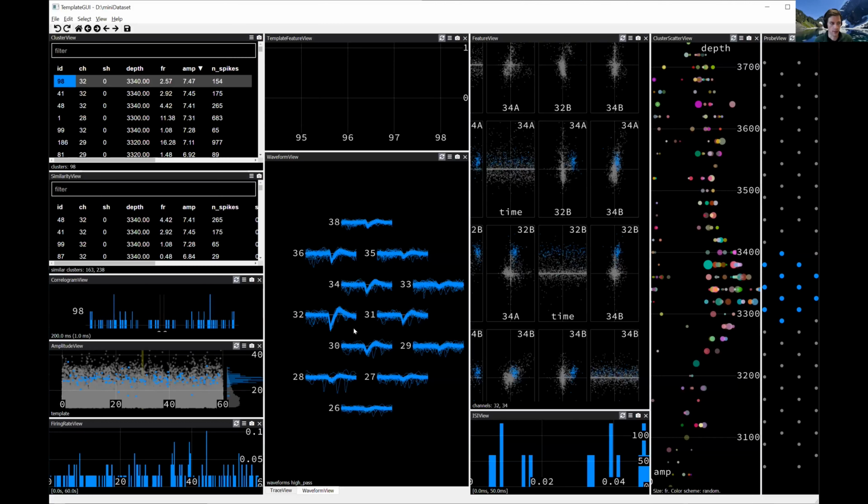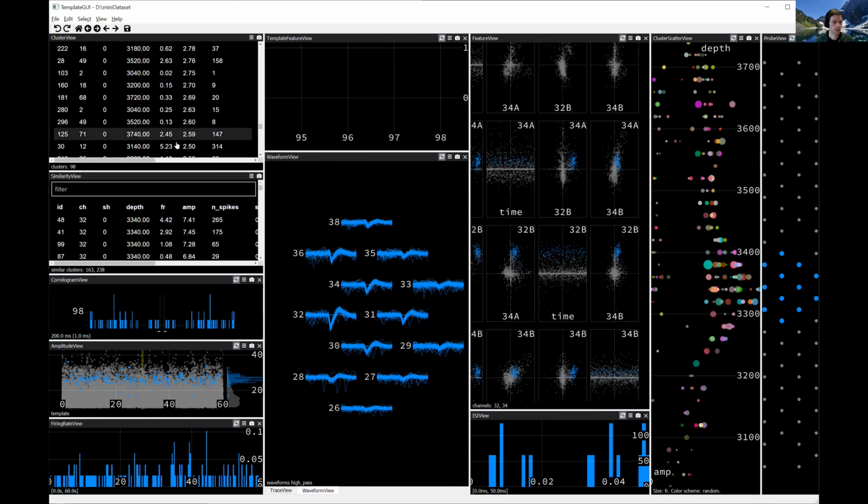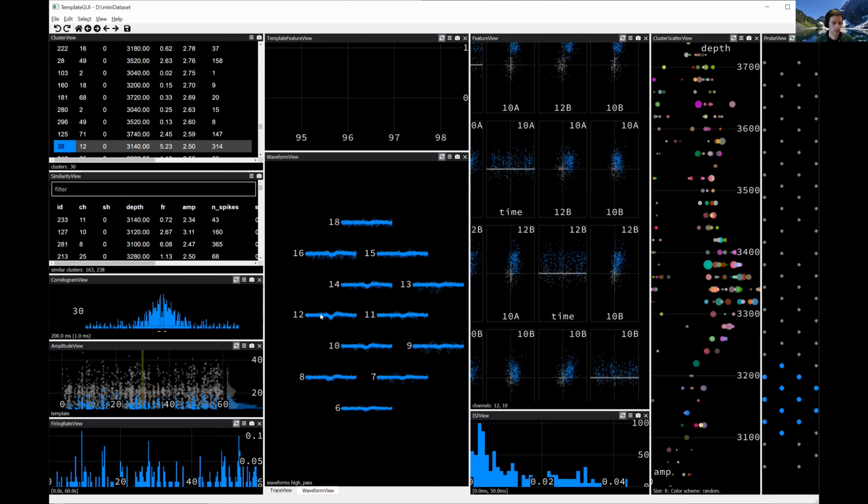So number one is the amplitude of the spike. A high amplitude neuron is literally further away from the noise and further away from other neurons that are around. And so a high amplitude spike like this one will be relatively better than a low amplitude one. I'm going to scroll down here and pick some guy that has low amplitude. Like this one, really low amplitude. And it's simple to imagine that this low amplitude one is evidently a neuron that's further away from the probe.